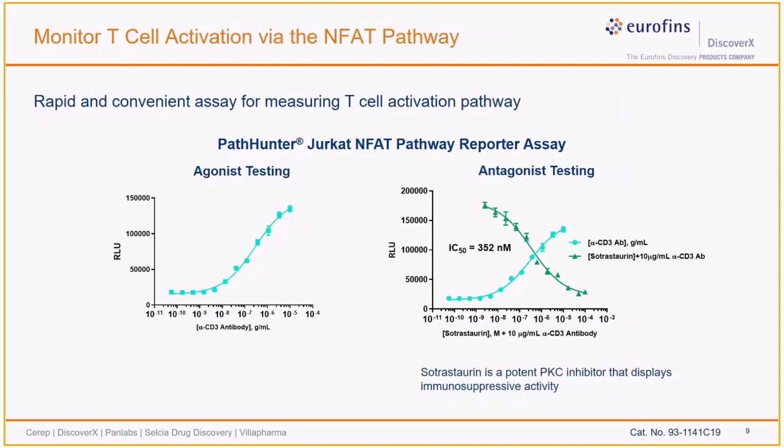So another reporter gene assay that we've developed is presented here and measures T cell activation occurring through the T cell receptor. This assay provides a much easier and quicker alternative to measuring T cell activation using proliferation or cytokine secretion assays that have been used previously.